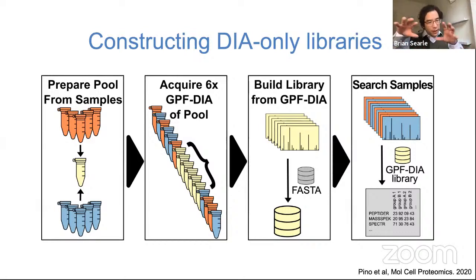And we'll analyze the ventriculars as one block and the lumbars as another block. So if you've got two very different types of samples, for example, if you're trying to compare two different cell lines or something like that, then that's a great way to go.